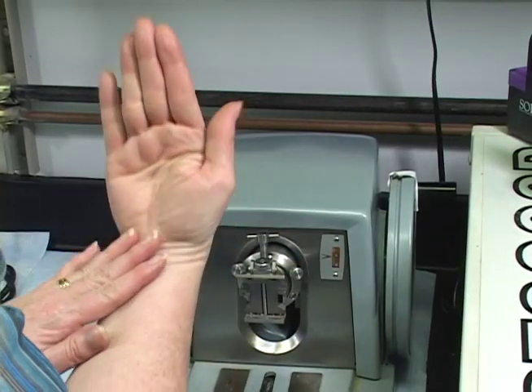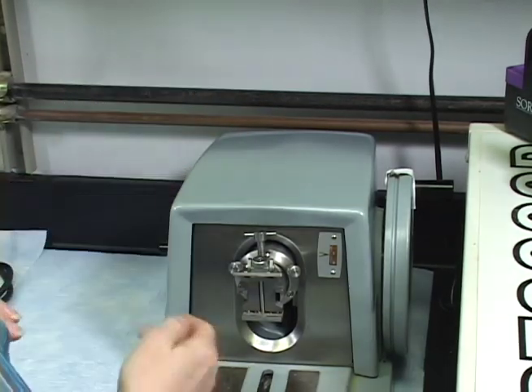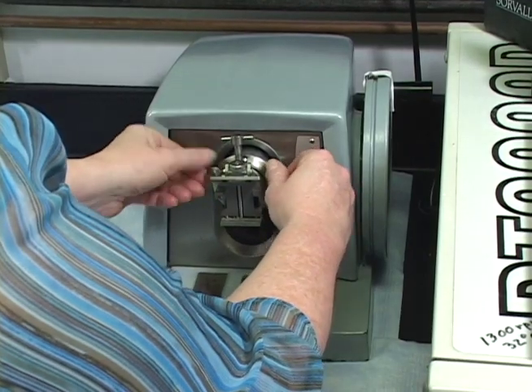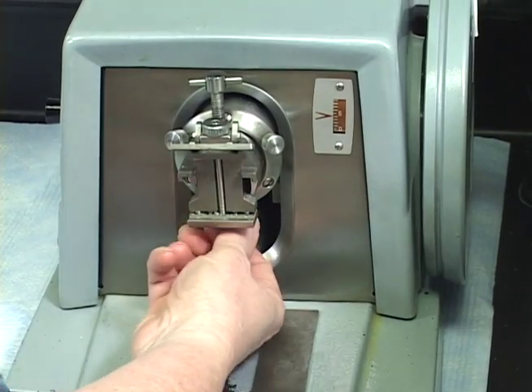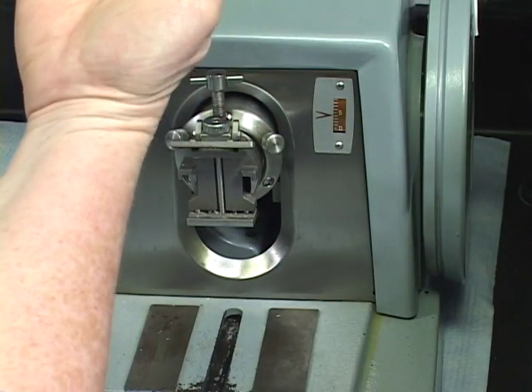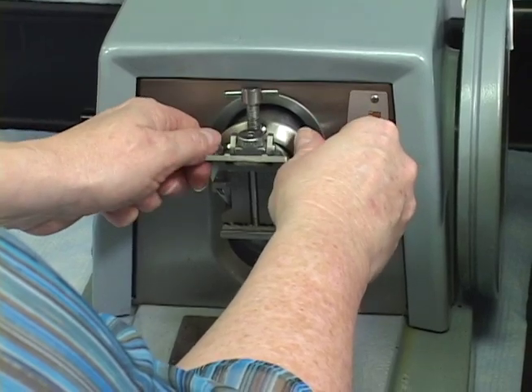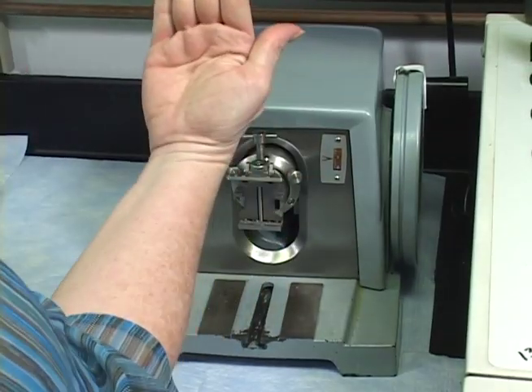If I want to tilt the block with the top going towards the back and the bottom out more, what I would have to do is loosen this bottom one and at the same time tighten these. And you can see it's tilting the block back. Again, I would loosen this bottom one and at the same time tighten these. If I need to move the block face forward more with the bottom going back, I would do the opposite. I would loosen these top ones and I would tighten this bottom one. And you can see it's moving the block face forward.